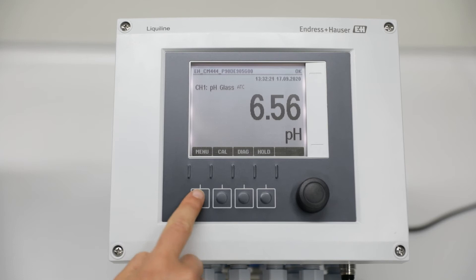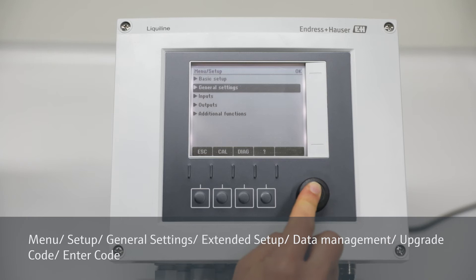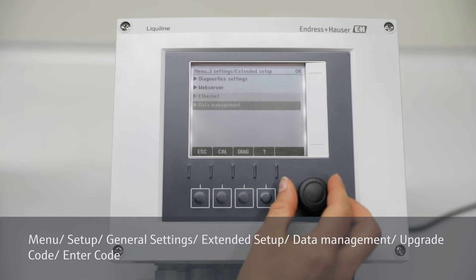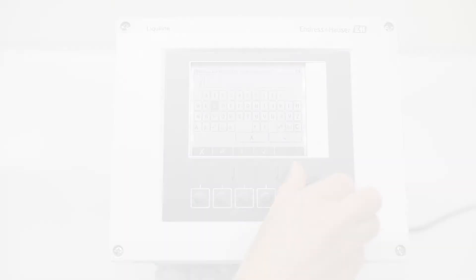Go to Menu, Setup, General Settings, Extended Setup, Data Management, Upgrade Code, then enter the code you received for this transmitter.